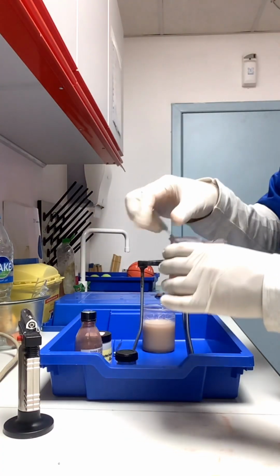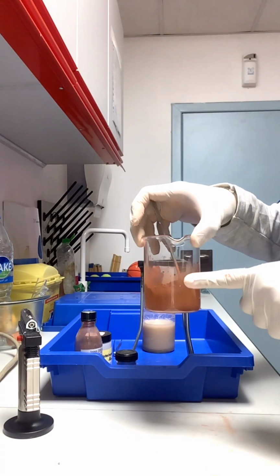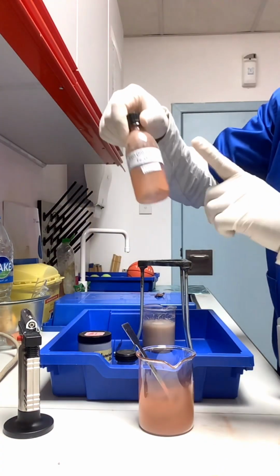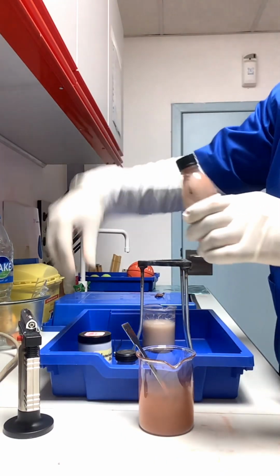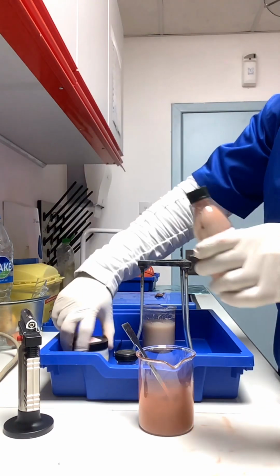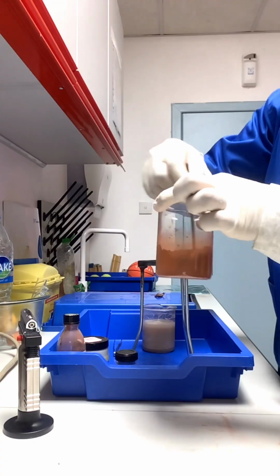As you can see, we have to take the iron oxide and aluminium together in the ratio of 80 by 30. So let's say we have taken around 8 grams of iron oxide, so you would need 3 grams of aluminium powder. Or in other words, I have taken 80 grams of iron oxide with 30 grams of aluminium powder and mixed them.